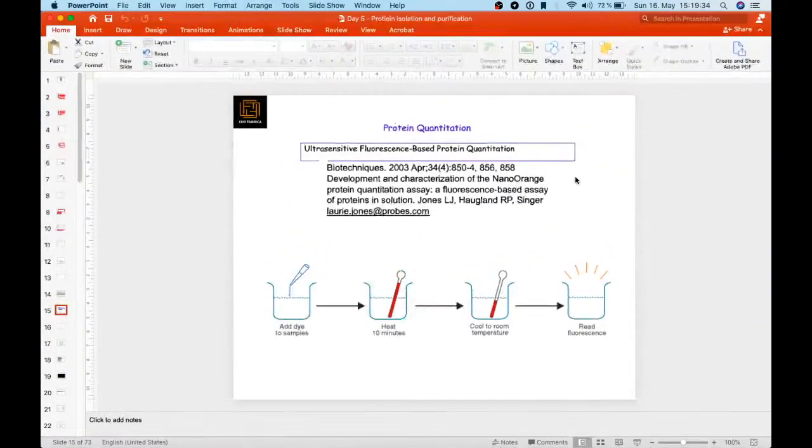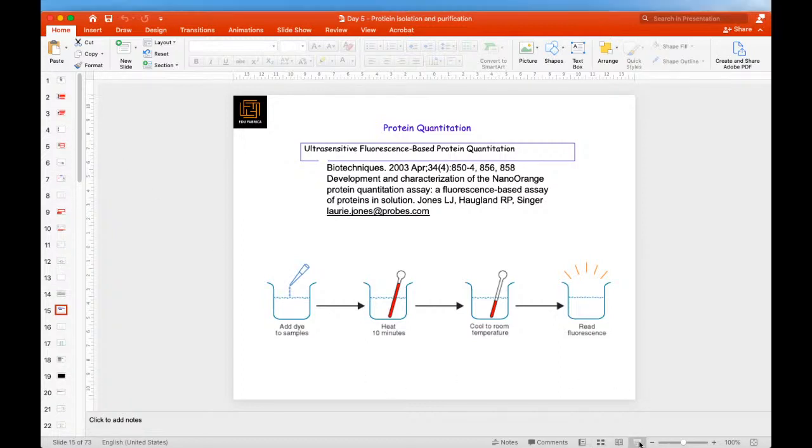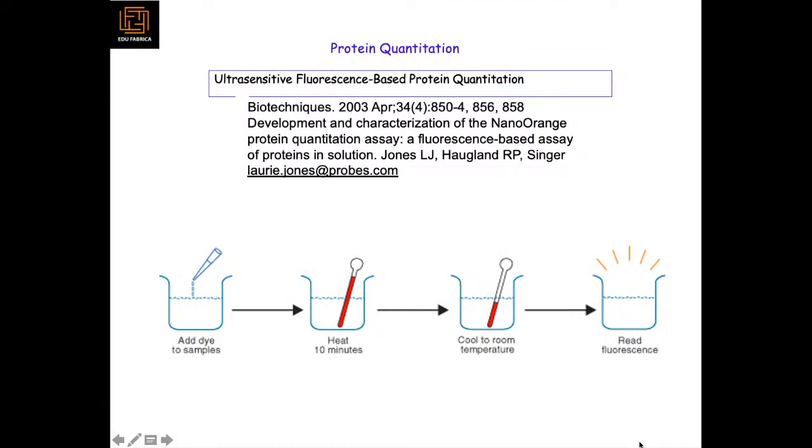So we will continue further. In our last lectures, we continued with protein isolation, quantitation and purification. In order to do so, first we learned some techniques with centrifugation. We can isolate the protein, and then we understood the quantification by the Lowry and Bradford methods, whereas mostly in the lab we use the Bradford method.